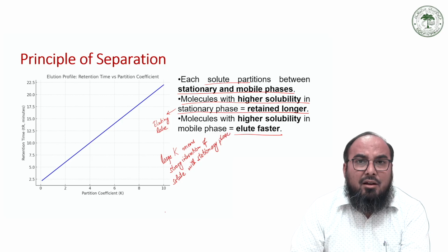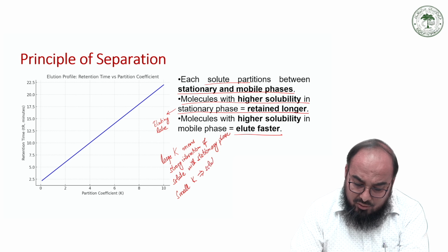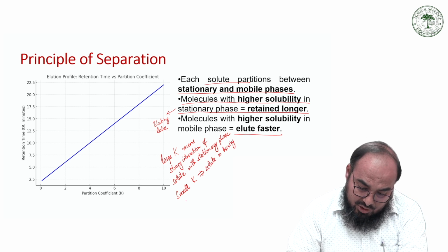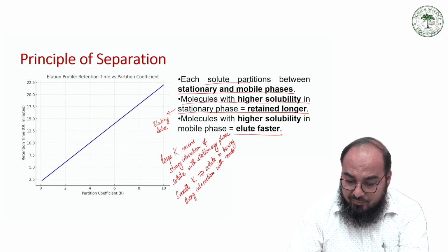Similarly, if you have a small K, it means the solute has a strong interaction with the mobile phase.